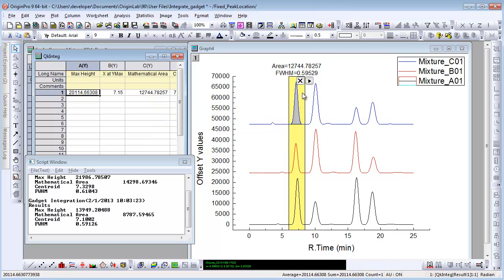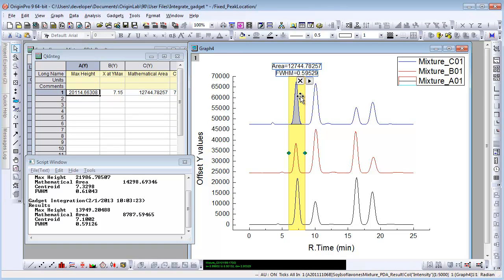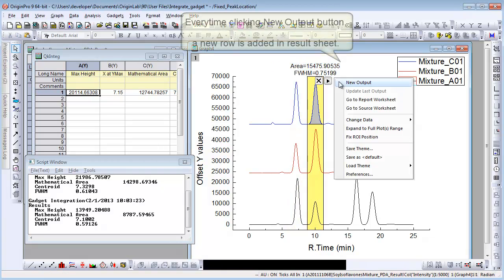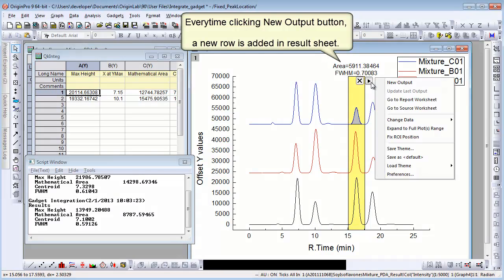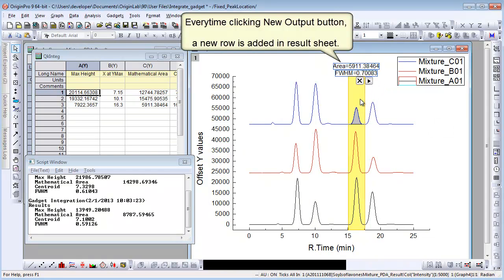Let's move the ROI box to Second Peak and choose New Output again. Another row is added in Output worksheet. So every time you click New Output button, a new row is added.